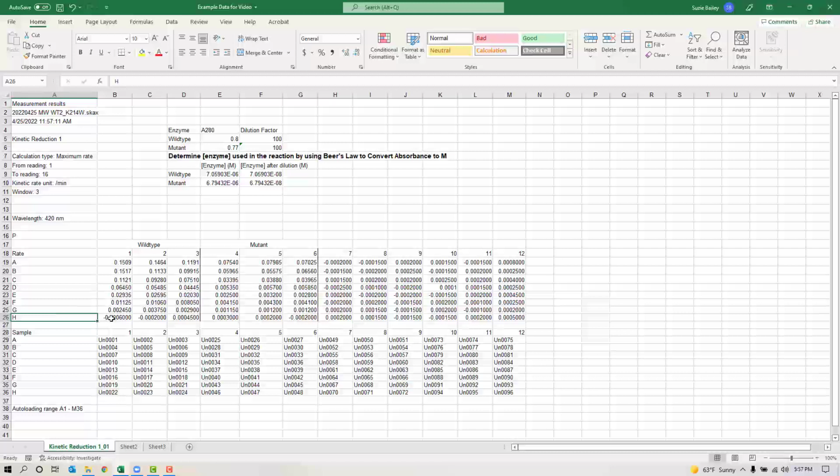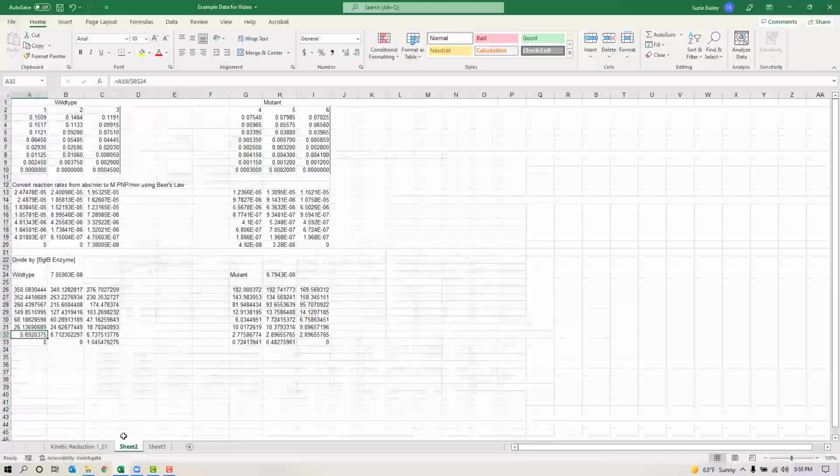And we get reaction rates of 0 as a result. And then row A had our highest concentration of substrate. So remember that those data going down each column are the reaction rates at decreasing substrate concentrations. The columns are exact replicates. So those are replicate data sets, and we're going to average across those replicates. So that's where we are now. We're going to determine the average.